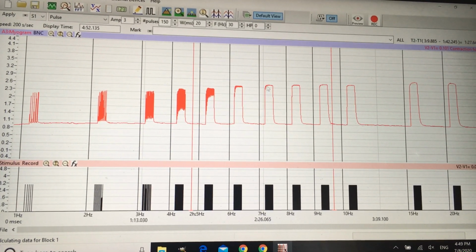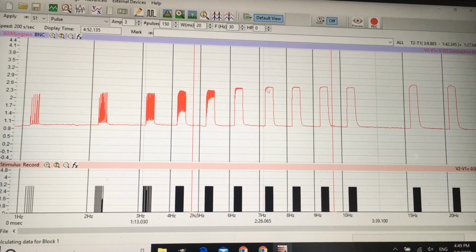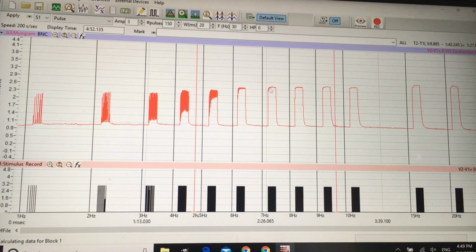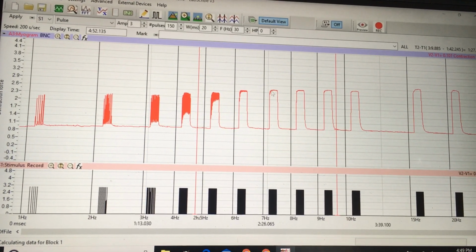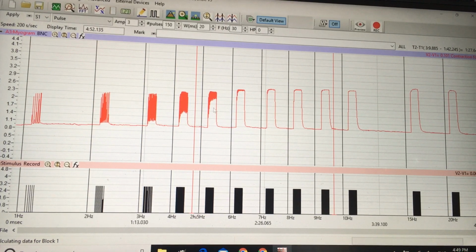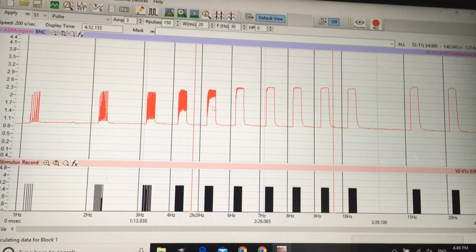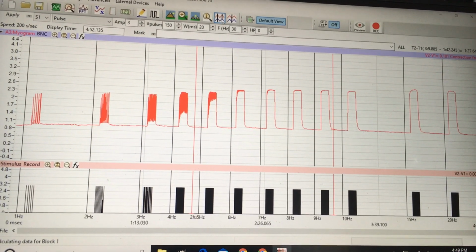So for the lab report, you need to analyze the force due to summation and total contraction force. I already mentioned that in the overview, so here I want to mention it again. For this one, it's so hard to measure. First thing is they want to show imaging how to do the 4 Hertz. Let me show how to do that.